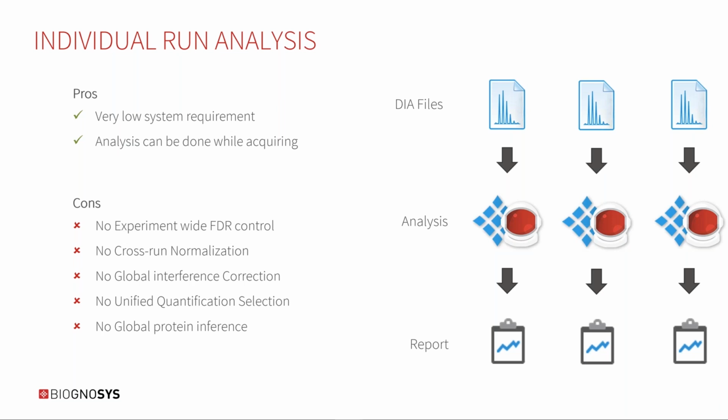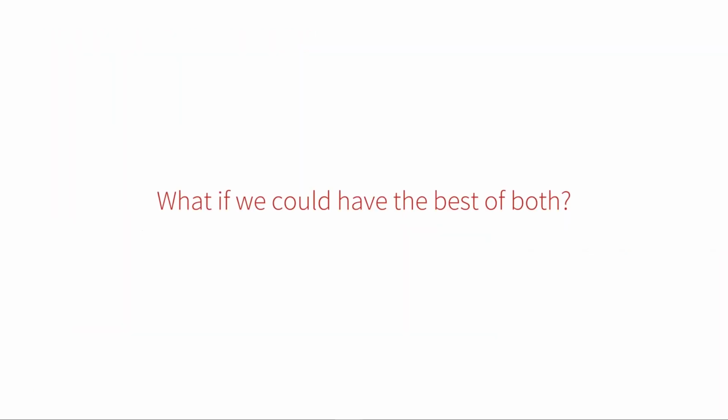So the question now is, is there a way where we can have the best of both? And that was something that we were also thinking about internally. And what we came up with is what Max already mentioned, our SNE combine pipeline.